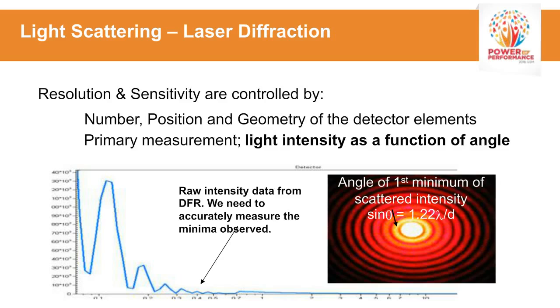The better you can define this distribution of your light scatter pattern, the more accurate the results can be. Also the resolution: being able to determine whether it is bimodal, monomodal, has 3 or 4 peaks, or a little side peak that might not be visible with some systems.